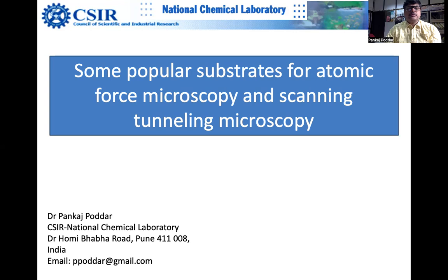Hi, today I will be talking about some popular substrates for atomic force microscopy and scanning tunneling microscopy.